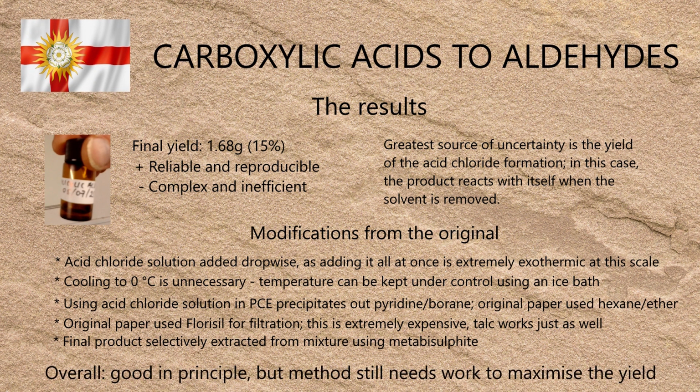In summary, this method delivers what it promises. It reduces acid chlorides to aldehydes near room temperature in a reliable manner, but in its current form it needs a lot more work to get a decent yield out of it.